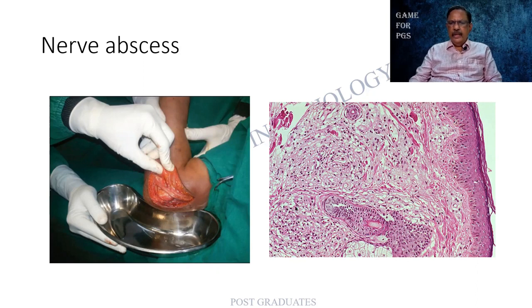And on this side, I am finding some vacuolated cells, but otherwise I can appreciate a spindle-shaped contour, and there is an overlying skin. So these are again modifications of the histiocytes. Usually in the hand or the elbow, there is one variant called the histioid Hansens, which can be present.